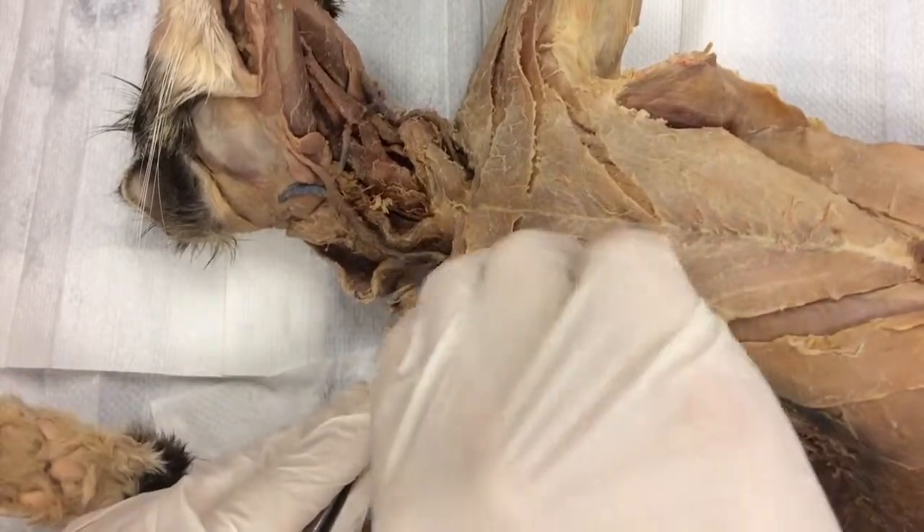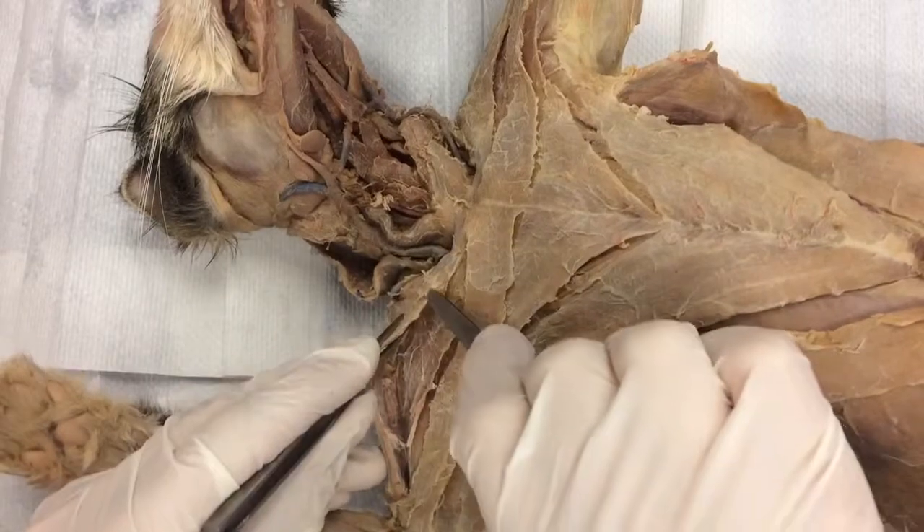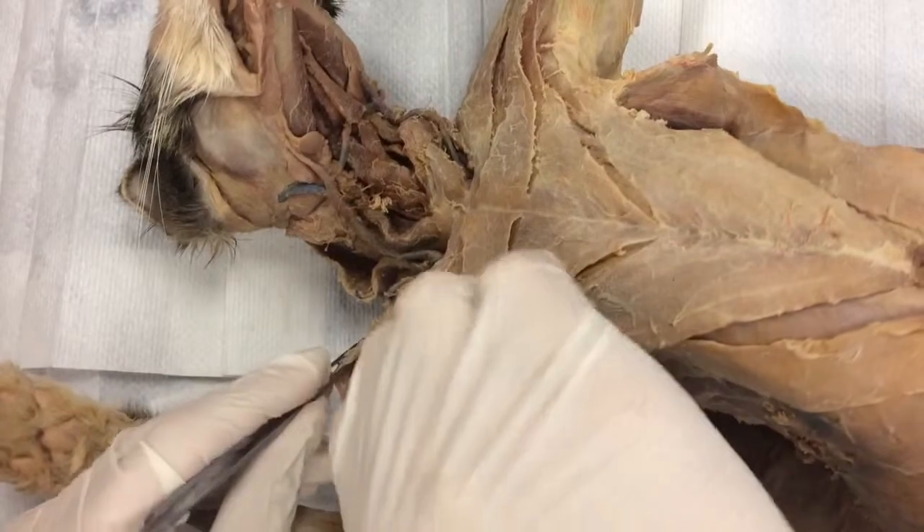I'm just going to keep going. This muscle is going to go all the way up into the throat area — it's going to be really super tight right here. We'll deal with that in a second. I'm just doing the easy part right now.